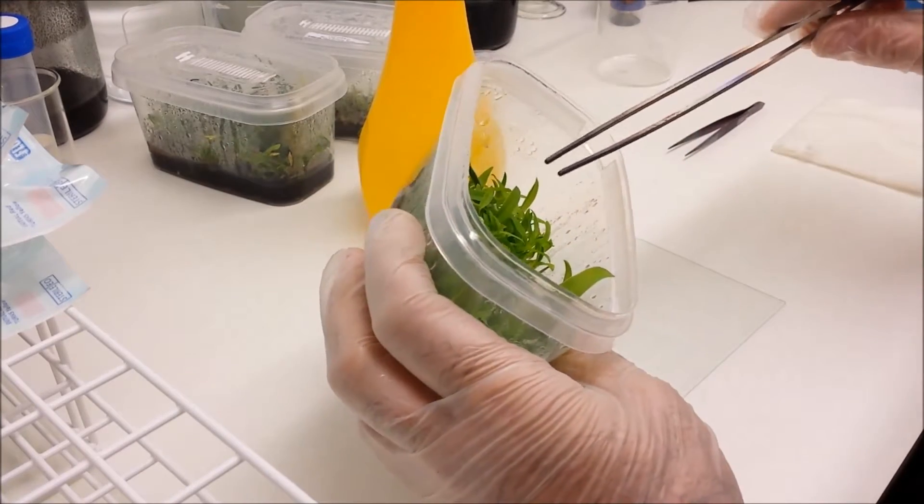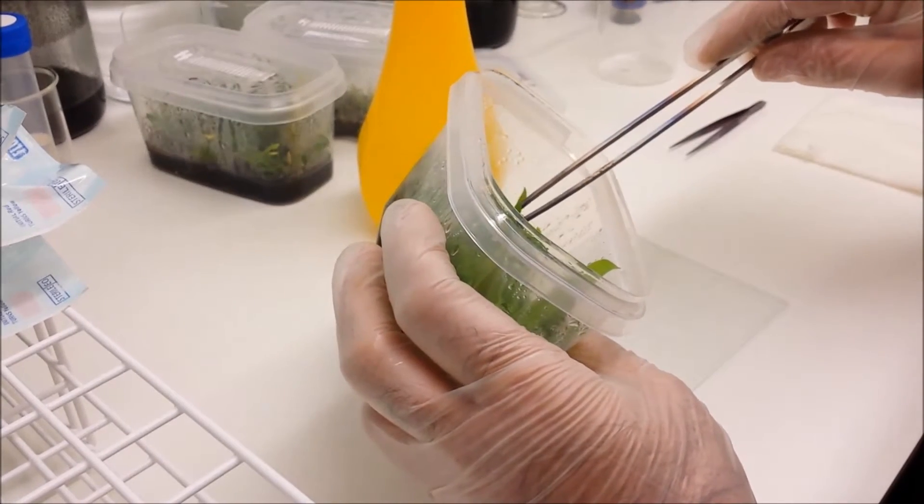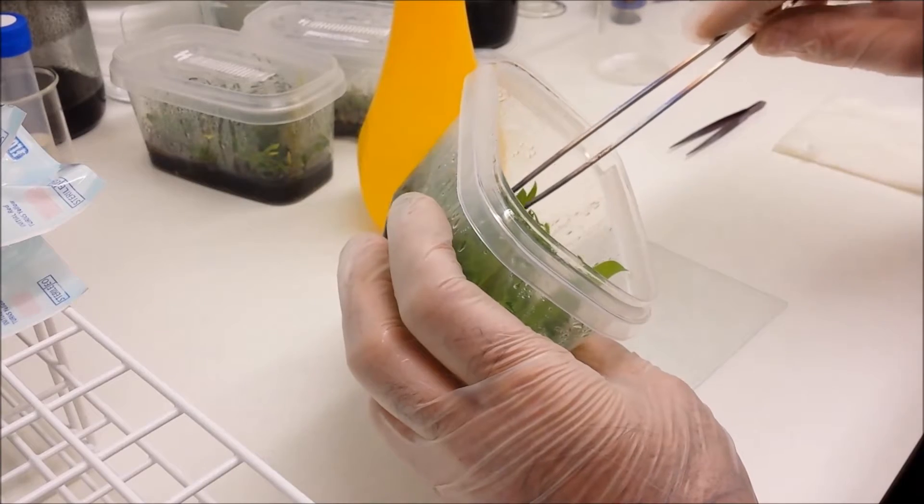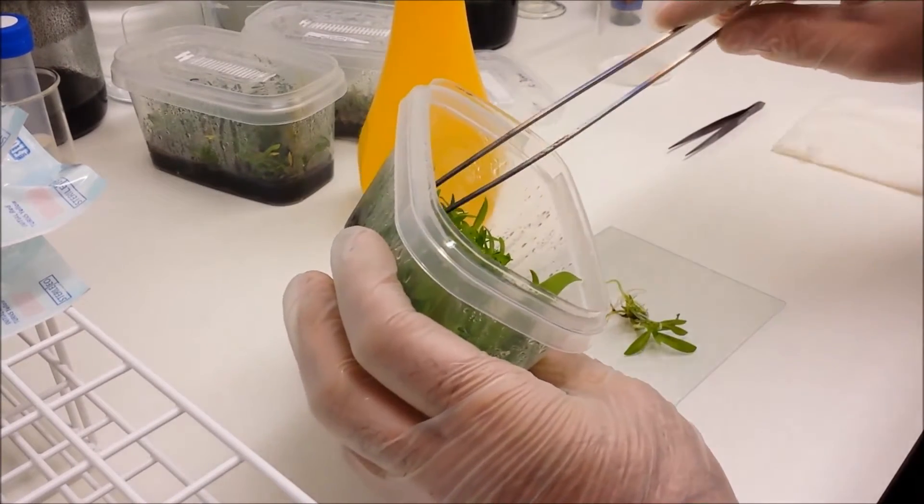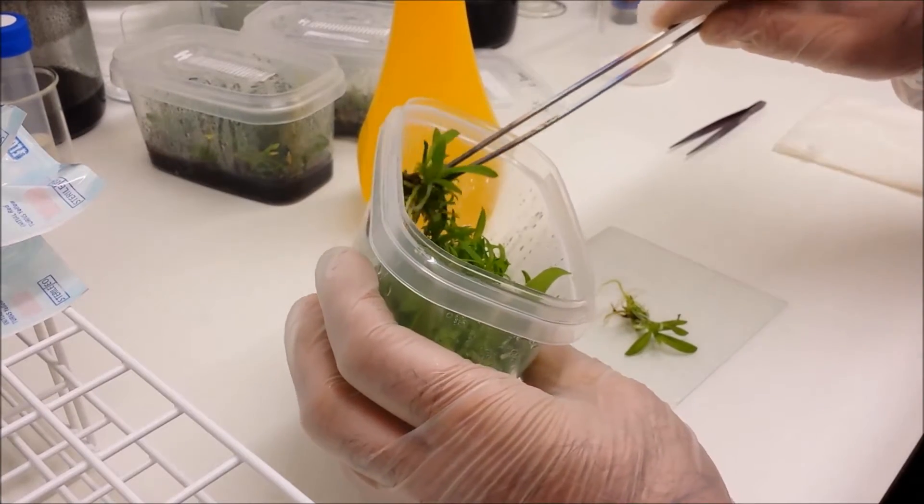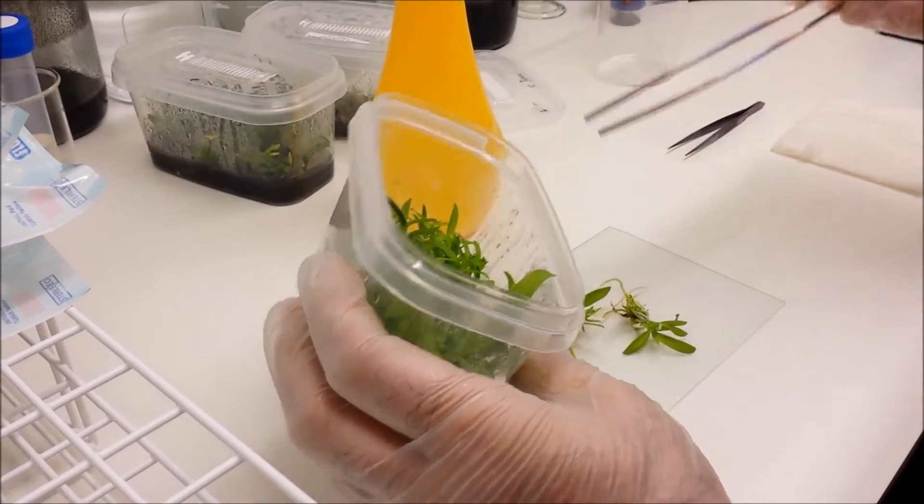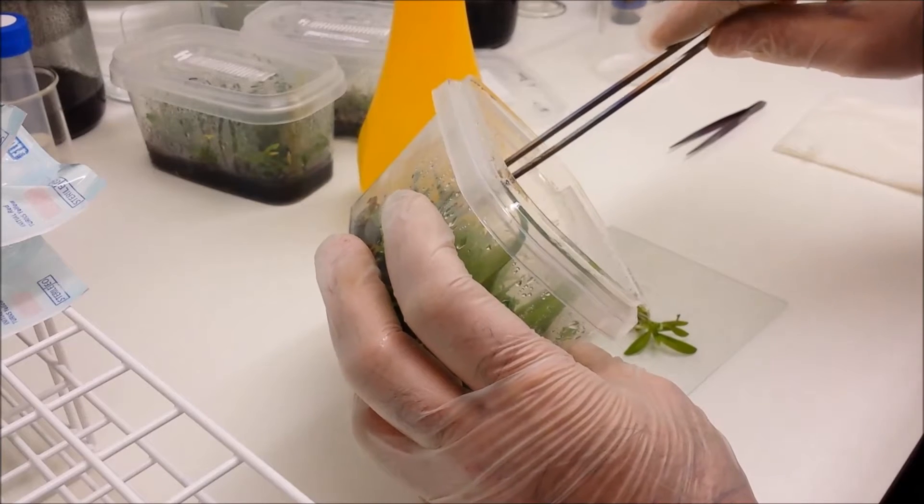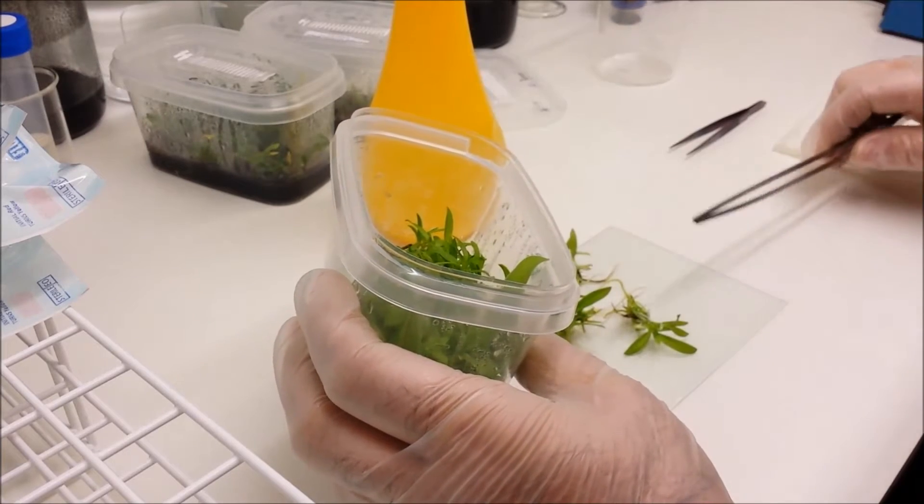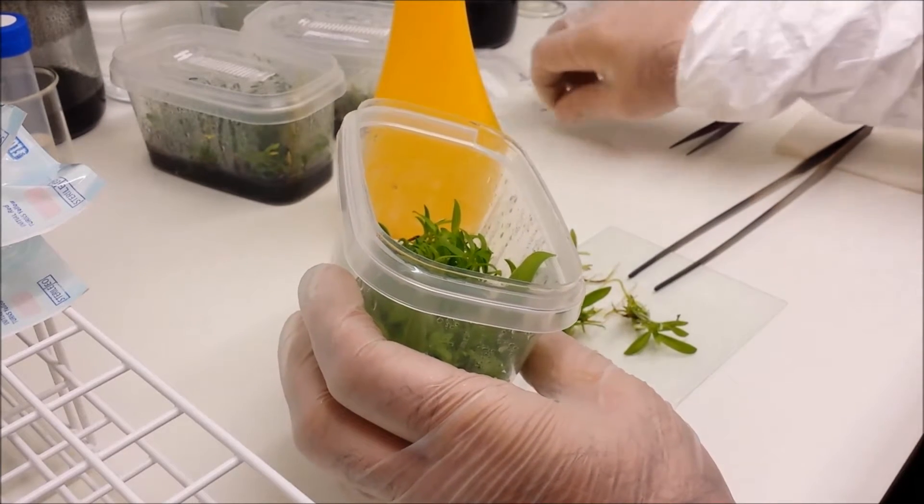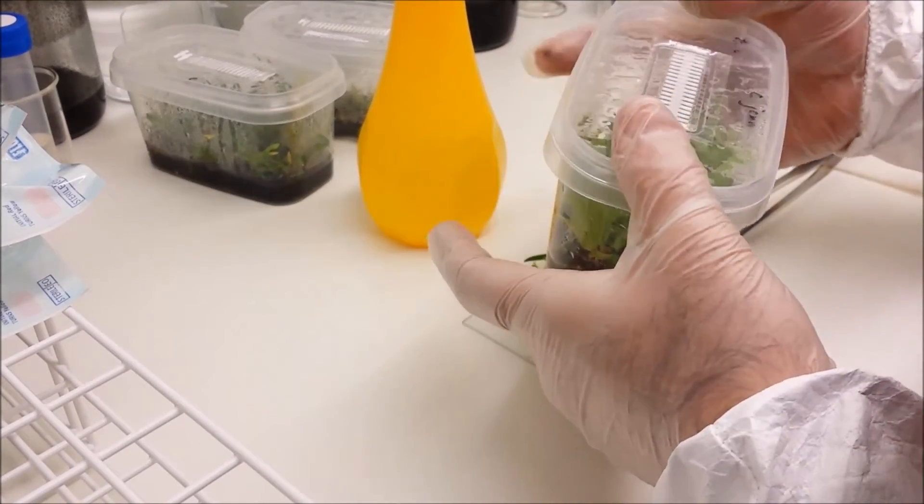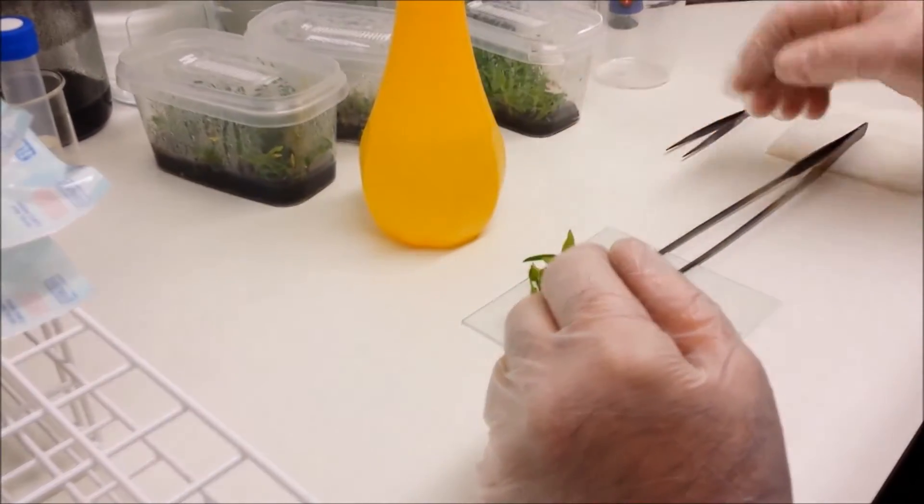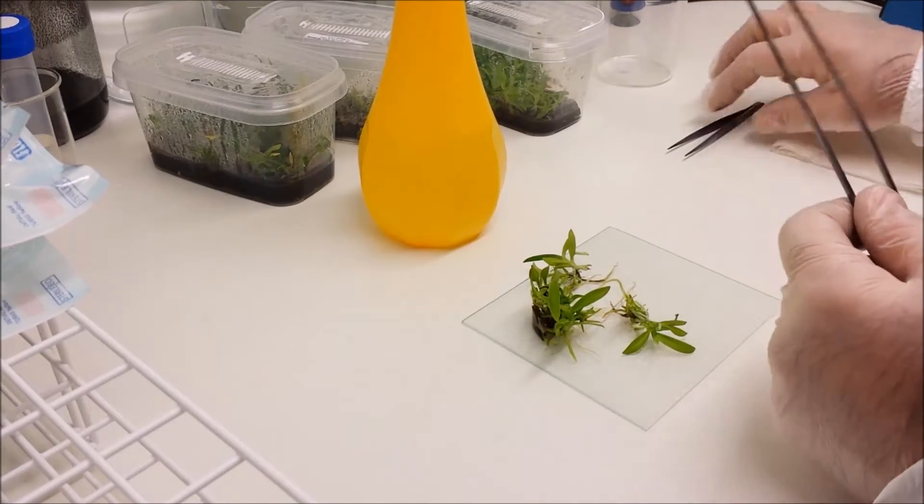Now using the long tweezers or forceps, I'm going to remove some clumps of plants. I'll try and get individuals if I can, but usually when they're this crowded in the pot, they tend to be tangled. So you might end up getting a few clumps out at a time. Put the tweezers back down on the sterile surface and replace the lid. It's most important. We can come back to those later.